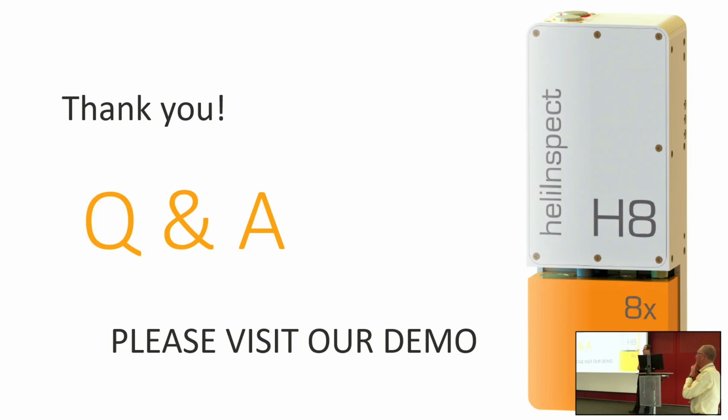If you're thinking about using multiple roughness values and having a correlation where the input is multiple S or multiple R values to one function, you're perfectly right, and we do that as well. But not for the reason of missing points. Heliotis devices all have super high dynamic range.